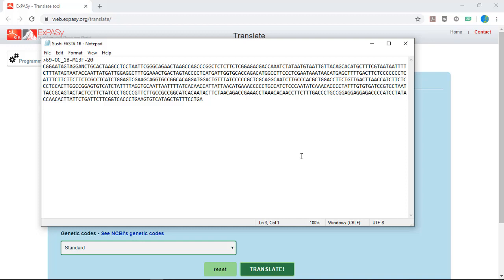This video will show you how to translate the FISH-CO1 gene nucleotide sequence to amino acids. We'll be using the XPACI Translate tool provided by the Swiss Institute of Bioinformatics. I've provided the link to this tool in your lab handout and below the video.